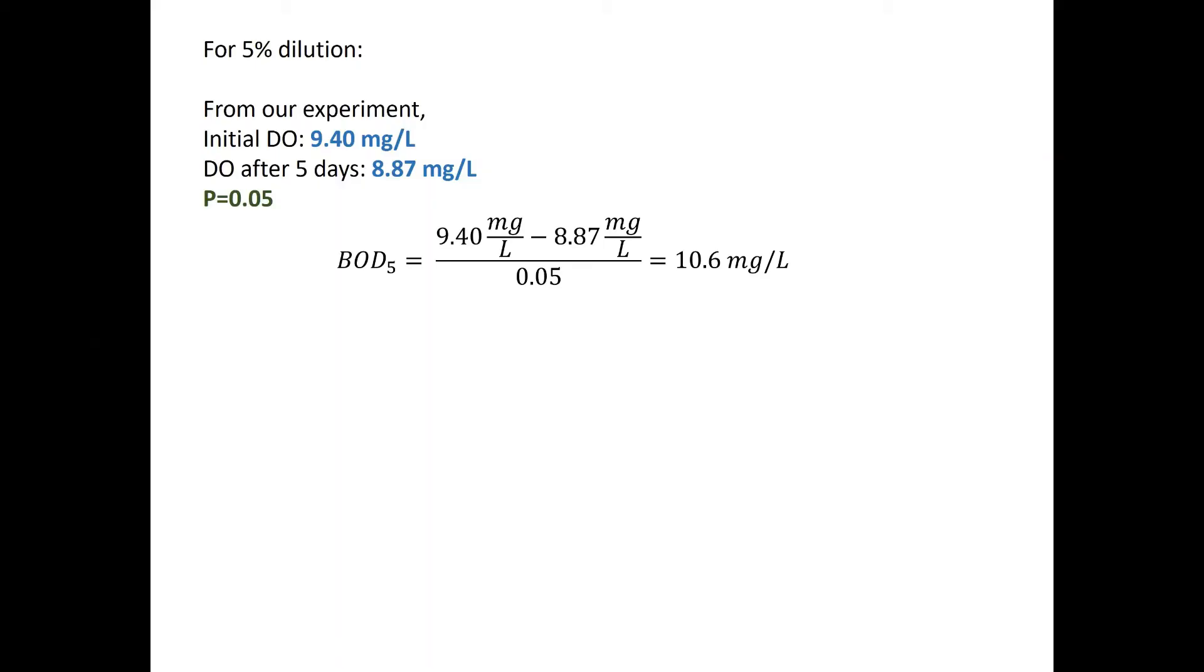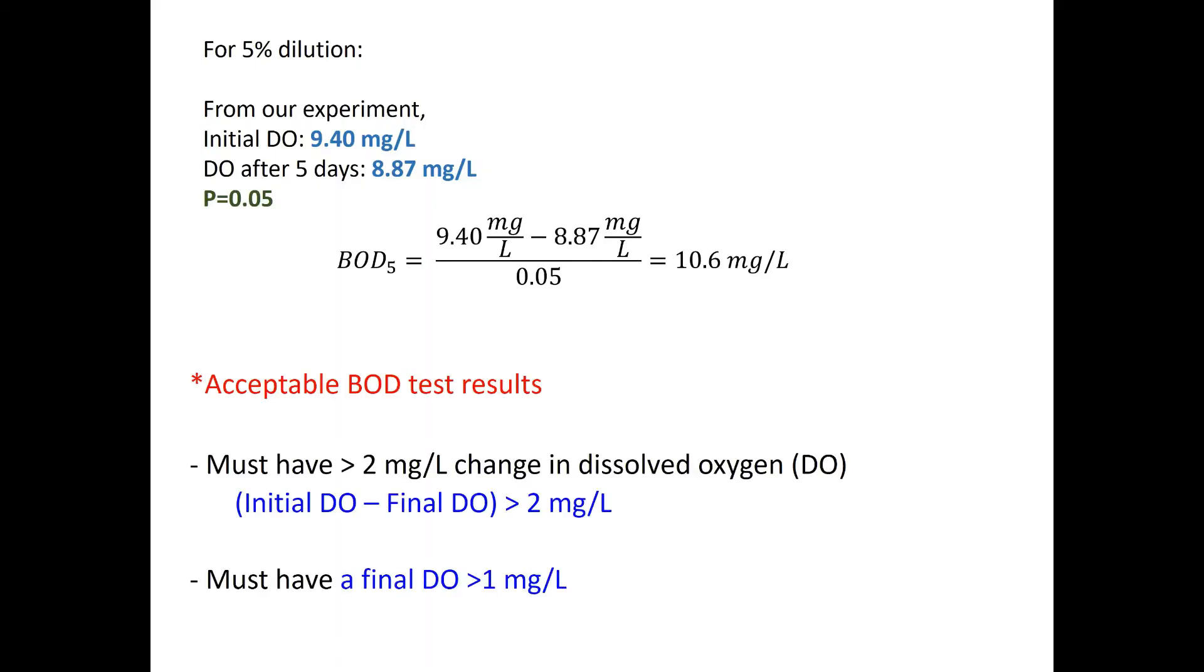However, we need to check first whether this BOD value is acceptable. We must have at least 2 mg/L change in DO concentration, and the final DO concentration must be higher than 1 mg/L. Our result meets the second one, but we only get a 0.53 mg/L difference in DO concentration, so this BOD value is not acceptable.